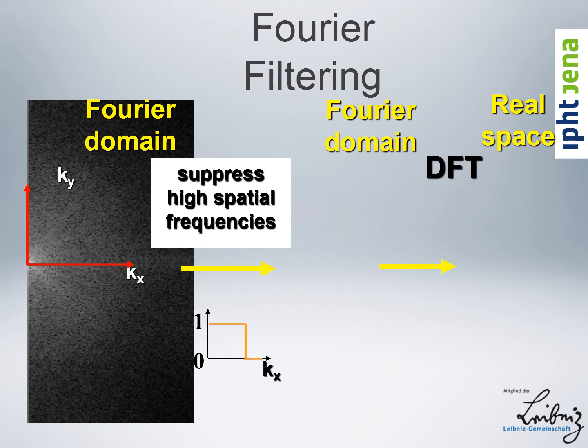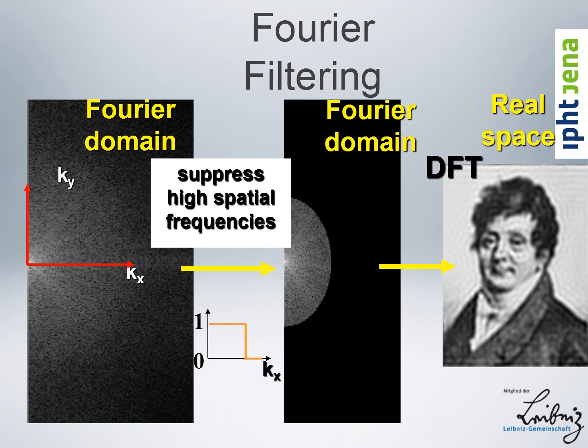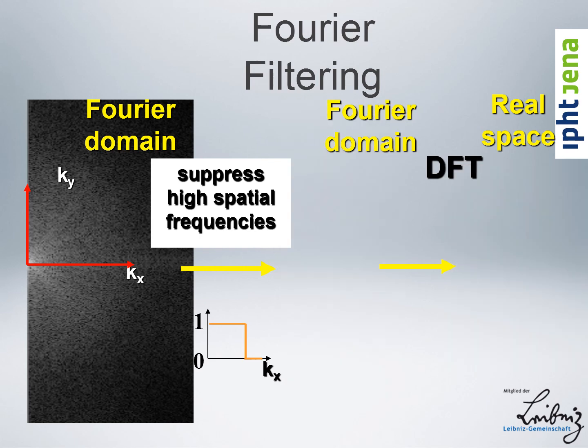We have some pictures. So this is the Fourier transform of Mr. Fourier shown here. And when we start to cut away frequencies, so this is our optical transfer function as a radial representation, we cut away the highest frequency, that looks still pretty fine. But when we cut more away, like shown here, then you see that Mr. Fourier starts to get more and more blurry. Because we're deleting the high frequency information, it's equivalent to fluffing him with a more coarse brush. This is a brush with lots of side lobes, as you can start to see. And you see the more we cut away, the more blurry he becomes.